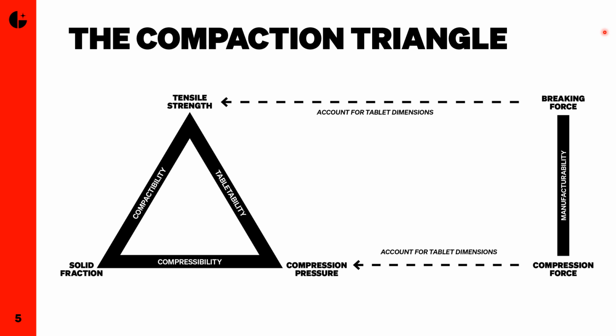So you can calculate the solid fraction of a mixture so long as you have the true density of each component. If you simply do not have the true density value available, you still have the tabletability relationship to work with, and this is often the most sensitive piece of information to differentiate between samples, and it's often the most useful piece of information.